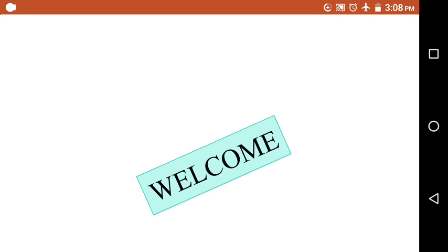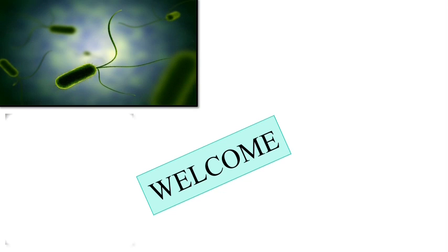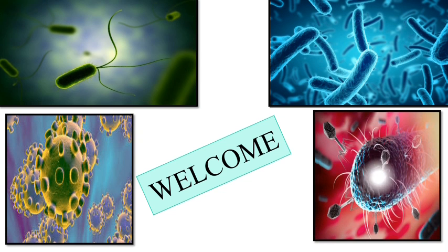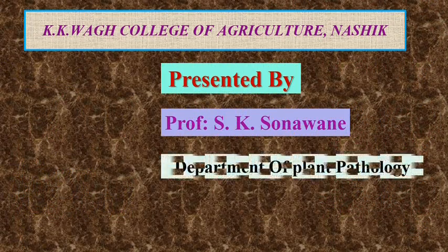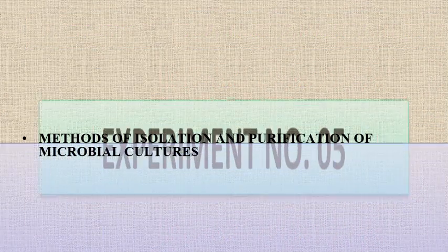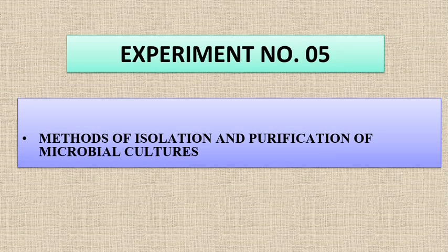Today I am presenting the topic under the practical syllabus of my introductory microbiology course from the Department of Plant Pathology. Today's presentation is exercise number 5, method of isolation and purification of microbial cultures.